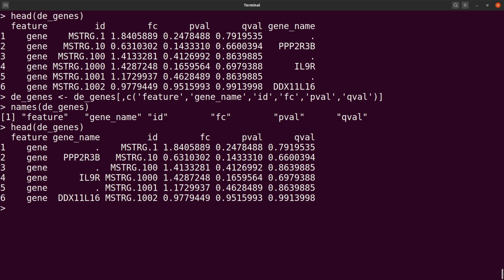Okay, so now everything is in order, and that's perfect. So that is what we want here. And so this is very interesting. I believe you are also following and enjoying whatever we are doing now. So this is the world of programming, and these things are very interesting to do. Okay, so let's proceed. Now let's clear the screen and then just continue.